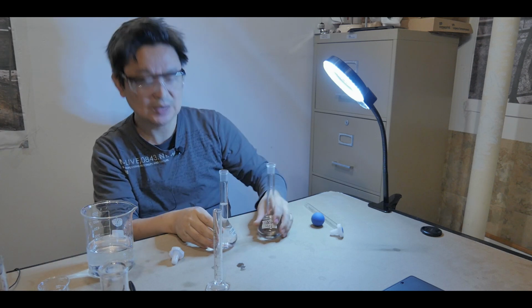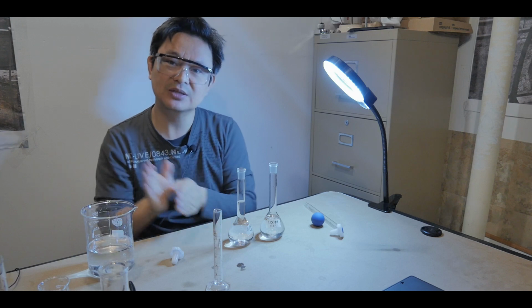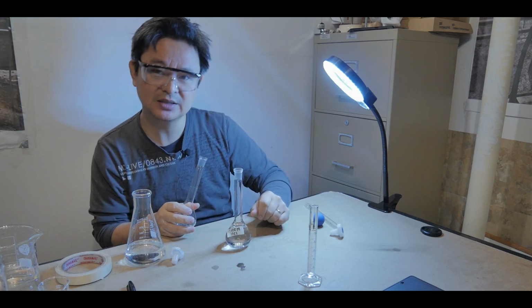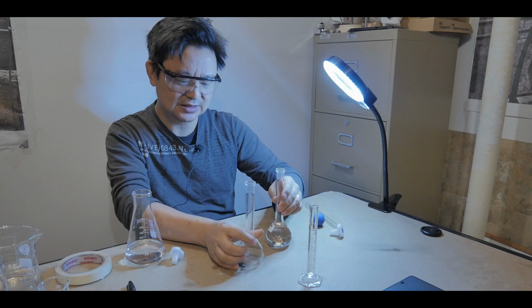I went from 1 molar to 0.1. Let's do one more. Let's do the 0.01 molar concentration. Okay, now we have that 0.100 molar concentration. We're going to make 0.01 molar concentration. So exactly the same thing here.